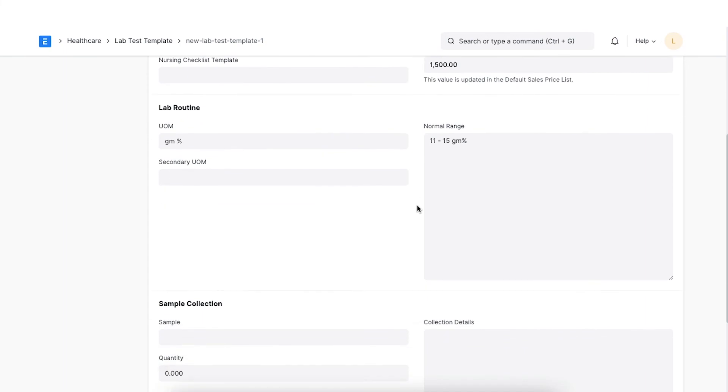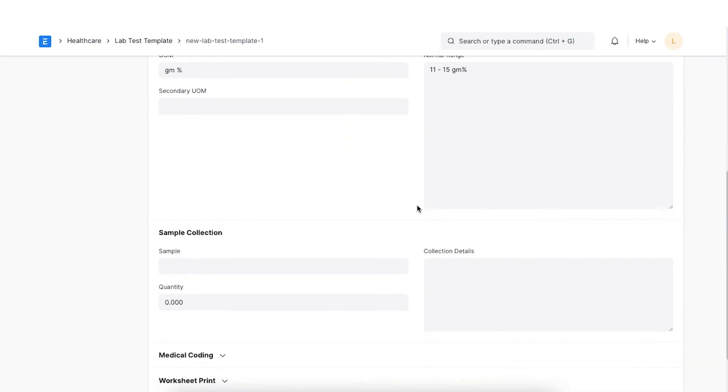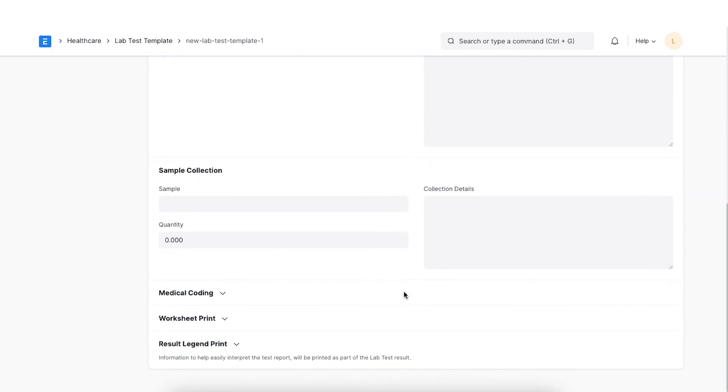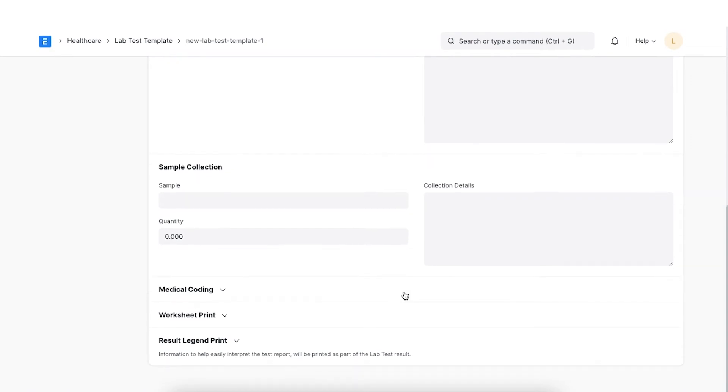We can configure the sample that has to be collected while creating the lab test. Select the lab test sample and set the UOM and quantity required.